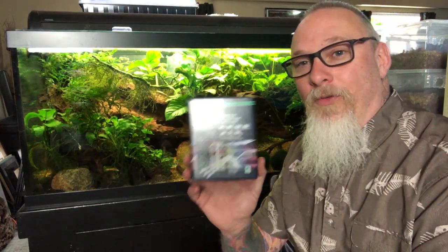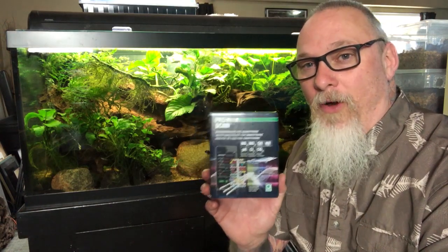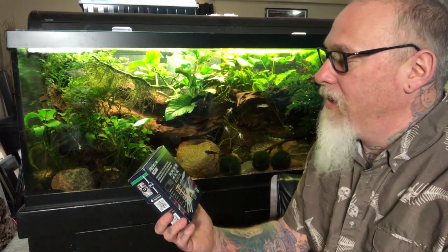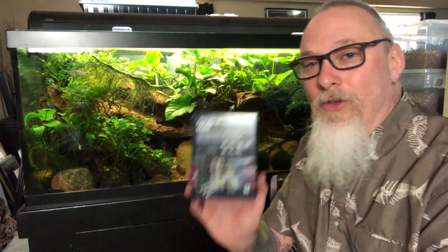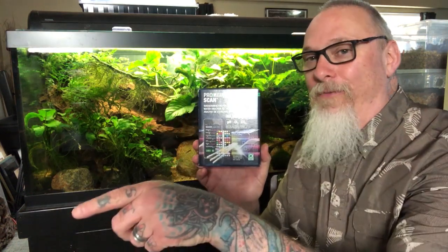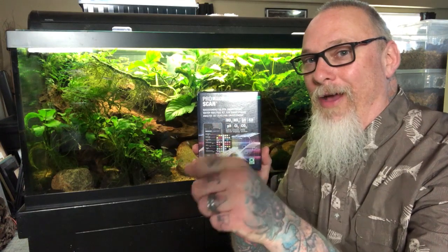I mentioned I was at my local fish wholesaler and he brought in a new product line from Germany. One of the products has no electronics whatsoever, and it is this product here. It's from a company — one of the biggest companies for aquatics in Germany — called JBL. This is the JBL ProScan, and it is a water analysis kit for your smartphone. You download the app onto your phone, and let's get my phone and I'll show you how it works.